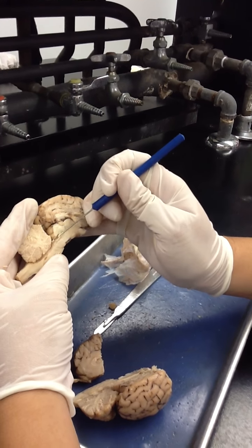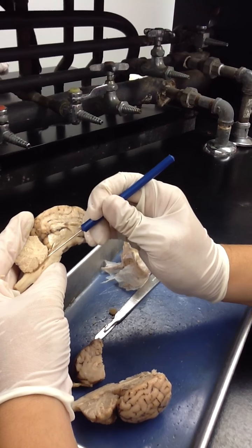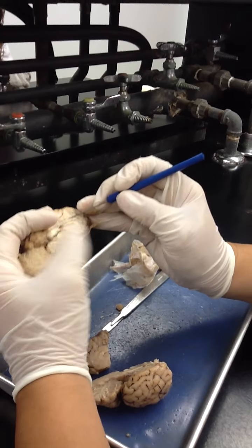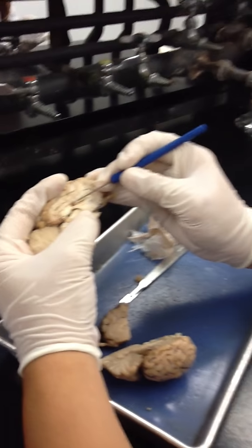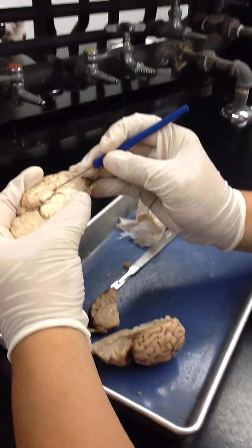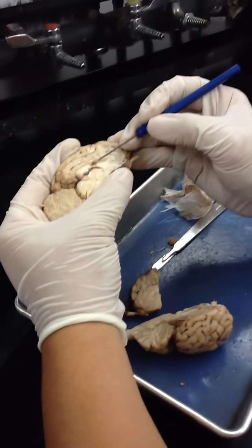Okay, and then there's going to be a little path to get to that. We call it the cerebral aqueduct. I'll point it out on this side. I think it's better. Okay, and then this stuff that I pulled out, by the way, this stuff is the choroid plexus. Okay, you were still recording, right? Yes. Okay, the choroid plexus.